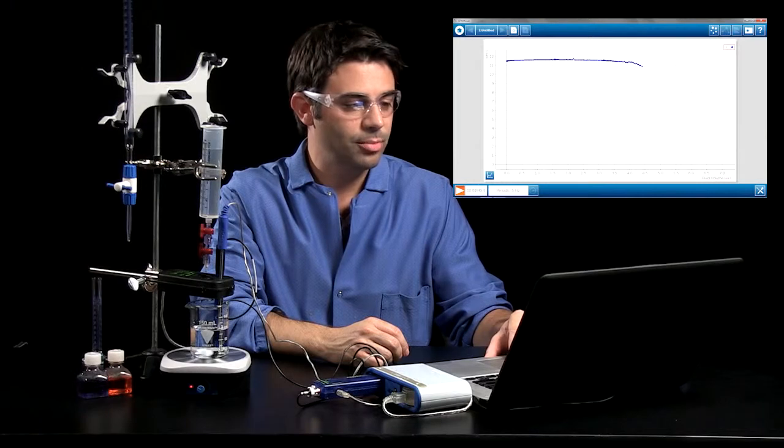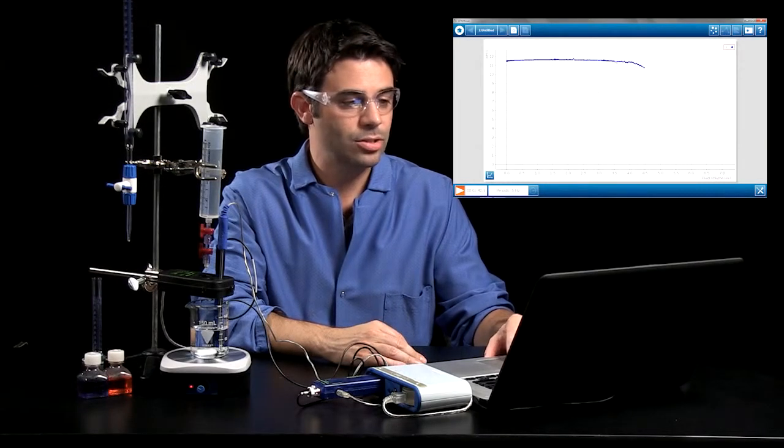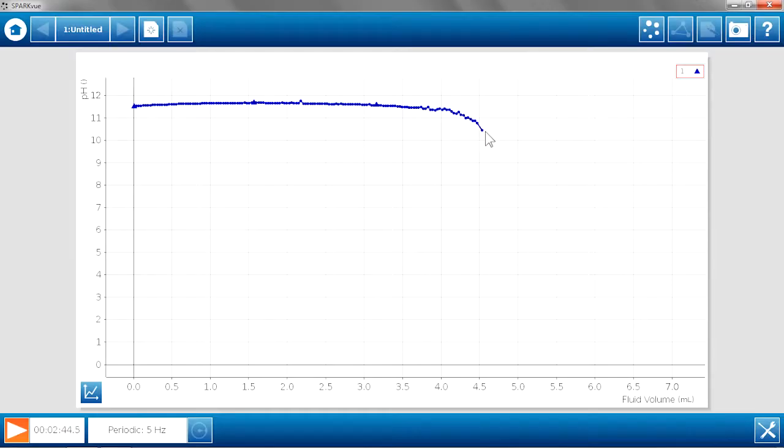So we can see, after a couple of minutes of data collection, the pH is starting to gradually go down. And now it's going down steeper. And now we see those big drops in pH that are indicative of the equivalence point being reached. And we'll let this go for a little bit longer to round out that pH curve.